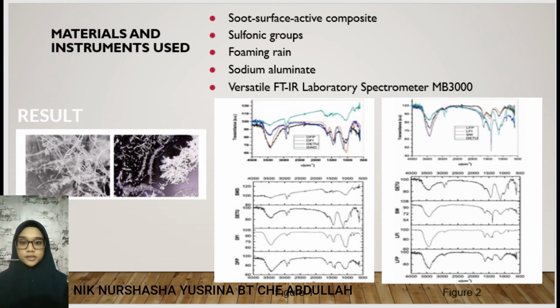Next is the result. As mentioned before, this journal is to identify the source that generates the foaming phenomena for the rainwater in two places, which are Lacy and Poistis, and we have two methods. First, we use filter paper and then glass slide.